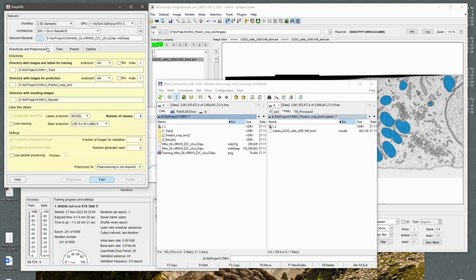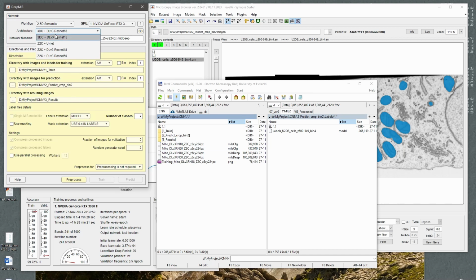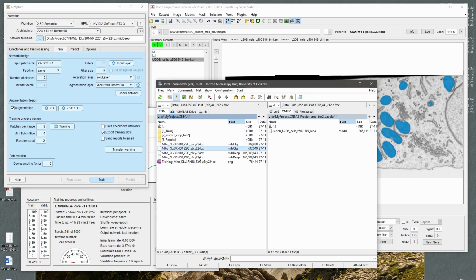and then now you can see here I have 4 files. These are the 2 configs, one of them for ResNet 18, which we used initially, and the other exactly the same copy of everything, but just called ResNet 50. And then in this loaded config, the new one, I just changed this to be ResNet 50, and then I hit the training. In this case, my initial training model will stay intact, and all new modifications will go to these 2 new files that I just created.